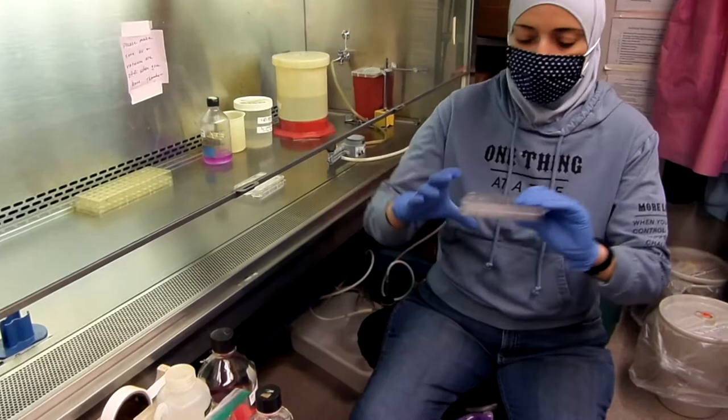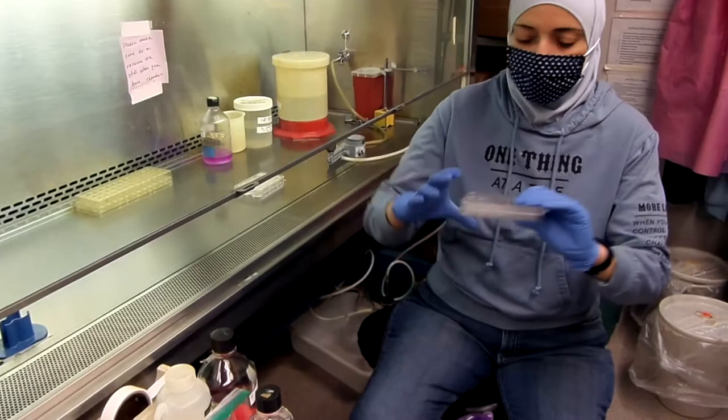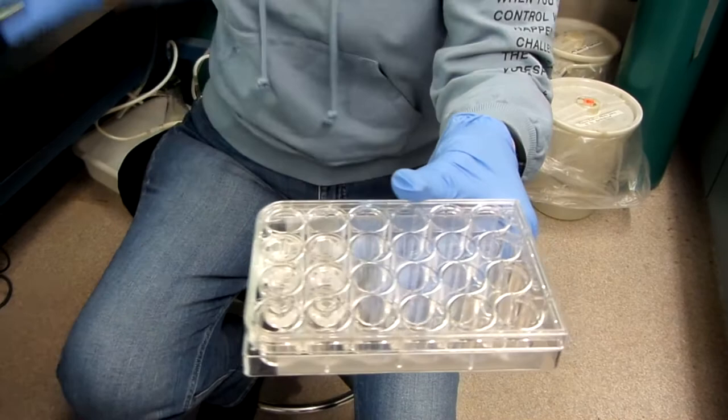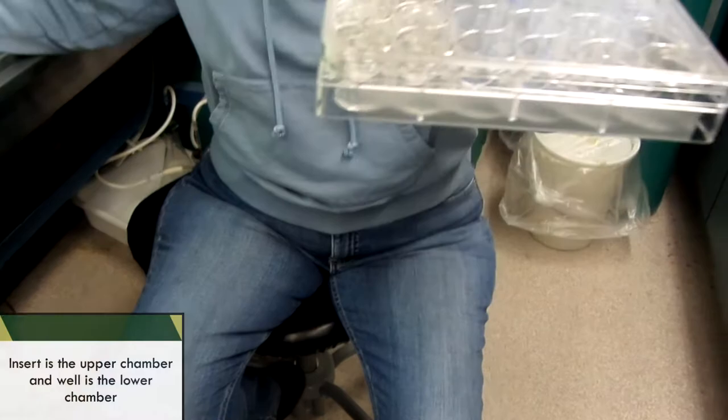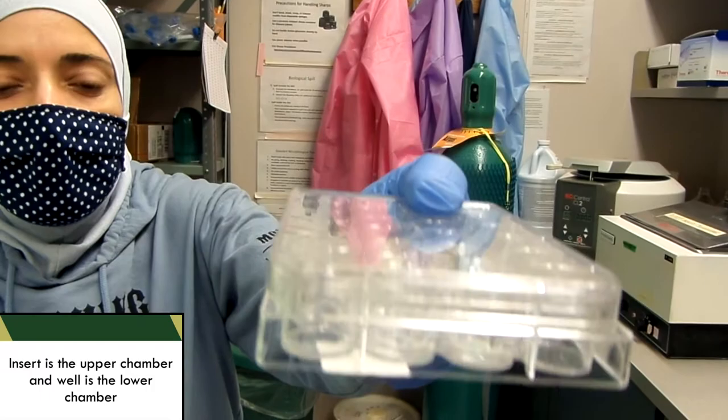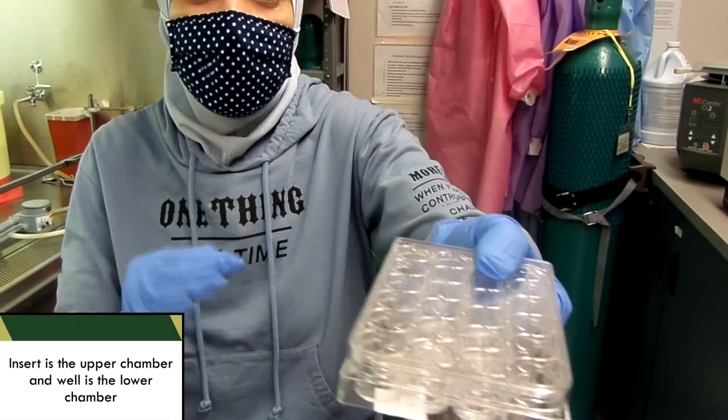So, we have this setup, and this is a trans-well plate. It's just a regular 24-well plate. You can buy 24-well plates, you can buy 6-well plates. And the idea is that these plates have an inset. Right now, maybe you cannot see it, but I'm going to show it to you when I have the plate inside the biosafety cabinet, because I have to keep everything sterile.